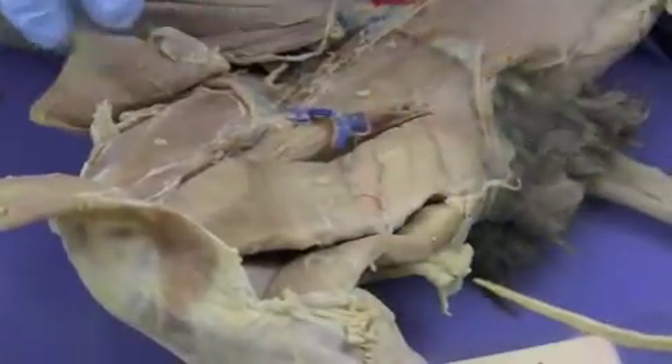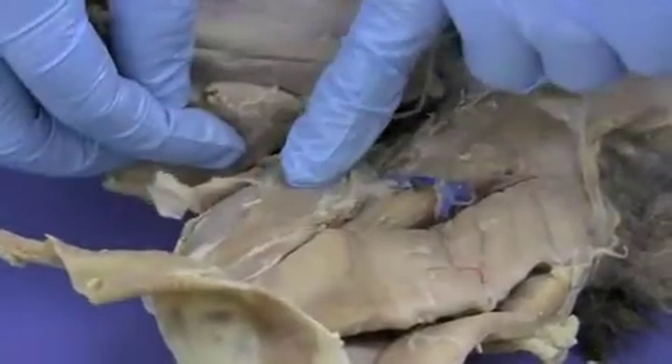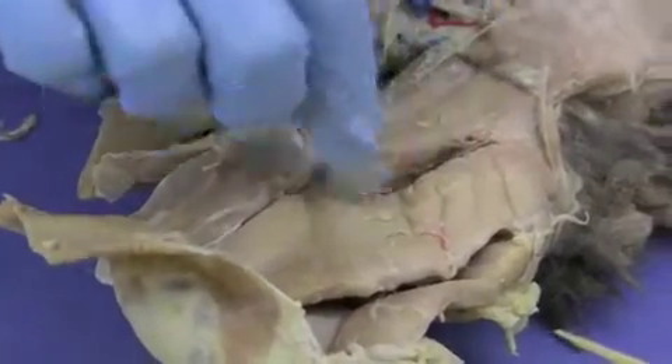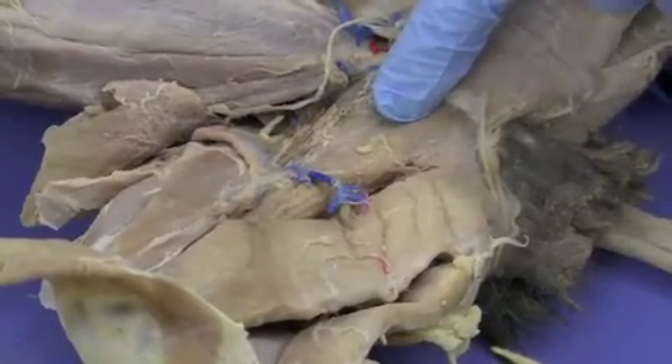The front of the thigh is made up of the quadriceps muscle, and you have the vastus medialis, the rectus femoris, and the vastus lateralis, which we'll see once we flip the cat. These muscles right here are called the adductor group — it's actually several muscles that all help to adduct your thigh.